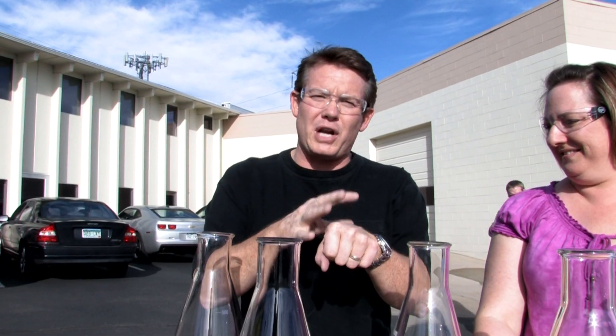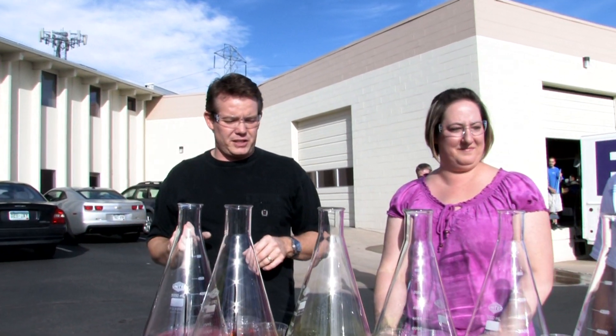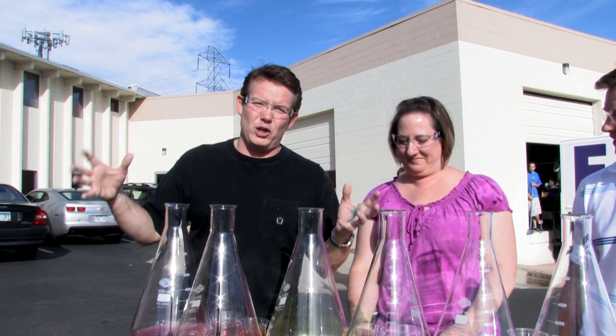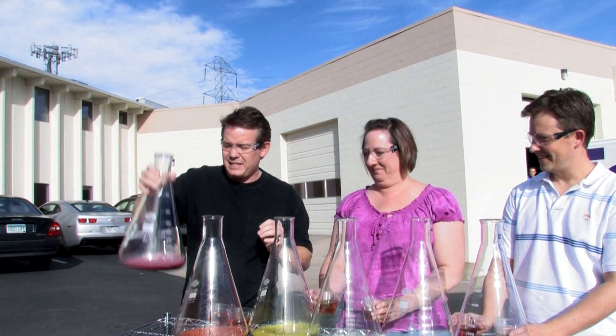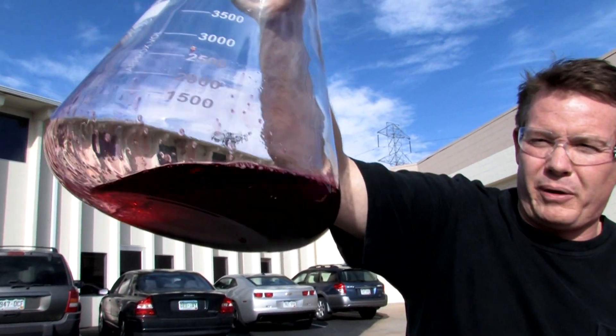You know when you were little and mom would put a little hydrogen peroxide on a cut? It was perfect because it produced oxygen, and that was three percent hydrogen peroxide. We have some hydrogen peroxide that happens to be just a little bit stronger in the flasks that you see here. Our catalyst is going to go down inside, and inside here we have hydrogen peroxide, a little bit of soap, and some food coloring.